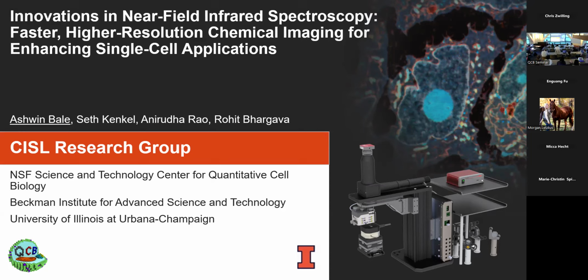So he'll tell you about their combined AFM-IR. I don't know if you'll touch on the machine learning aspect of it at all, Seth? No? That would be a third speaker that we would probably need for that. But to help resolve the spectra, because those who have a chemistry background know, a lot of the same molecules, well, guess what? They have CH, CC bonds and CN bonds. So there's a lot of similarity, and then trying to be able to differentiate them.